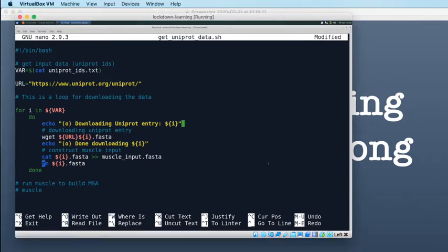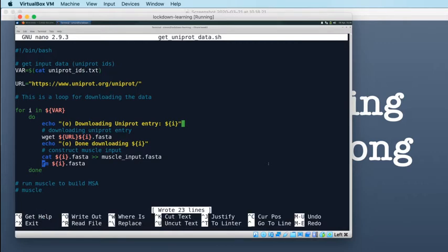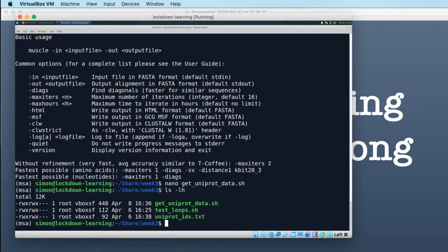So at this point, I'm going to save my script. So Control O to save my script. Press Enter to keep it in the same file name, which for now is fine. And then Control X to exit Nano. Okay, and then we're going to run that script. So my script is already executable. Let's just check. ls -lh, just check that it's executable. Remember, in my share folder, all of my files are executable, and they're all executable by the group.